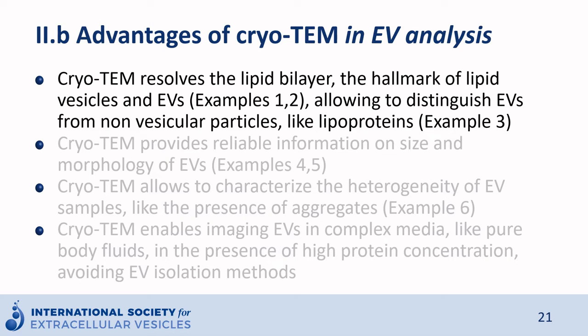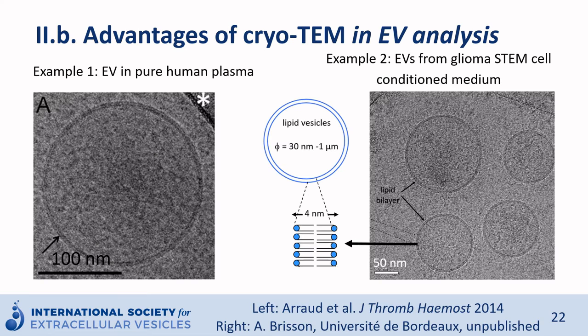Now, the advantages of cryo-TEM in EV analysis: there are many. First, cryo-TEM resolves the lipid bilayer, which is the hallmark of lipid vesicles and EVs. This is very important as it allows us to distinguish EVs from non-vesicular particles like lipoproteins. Let's look at some examples already.